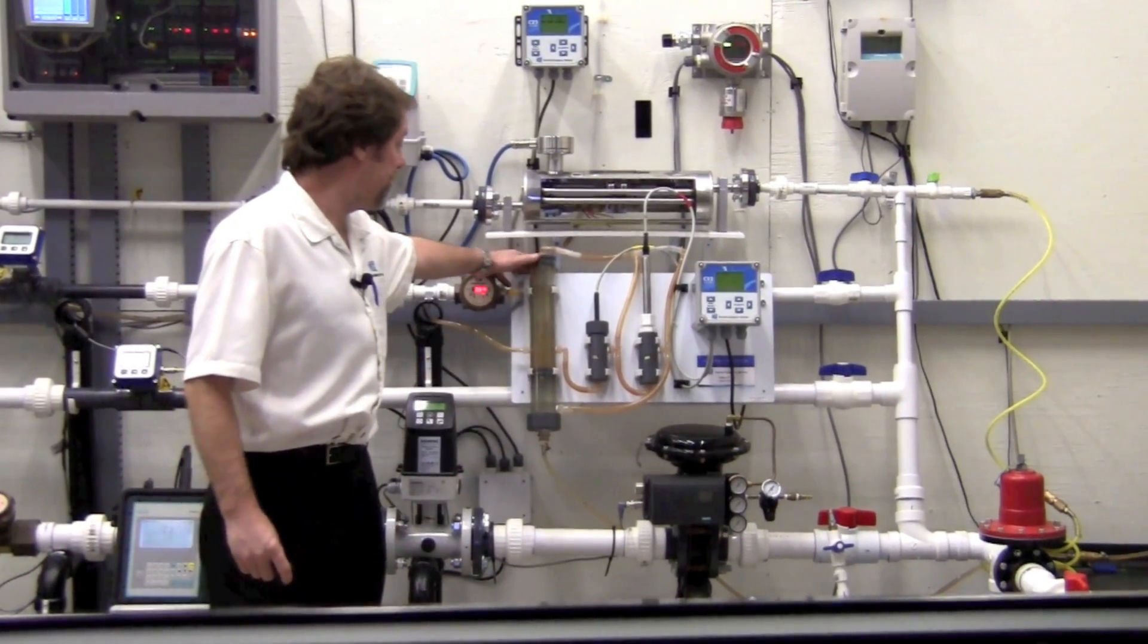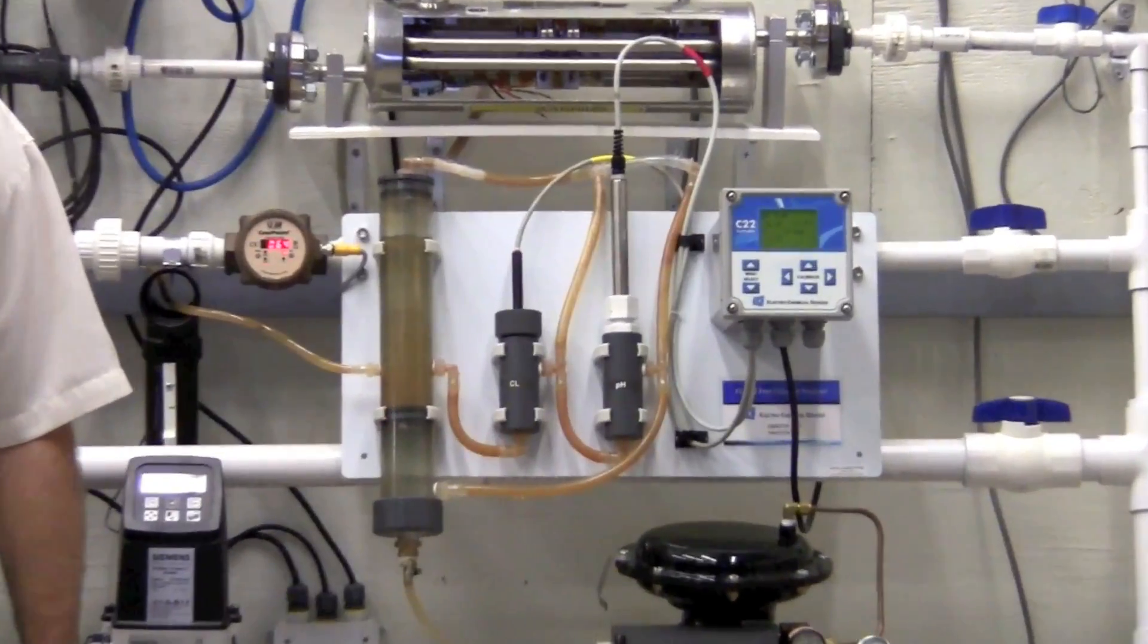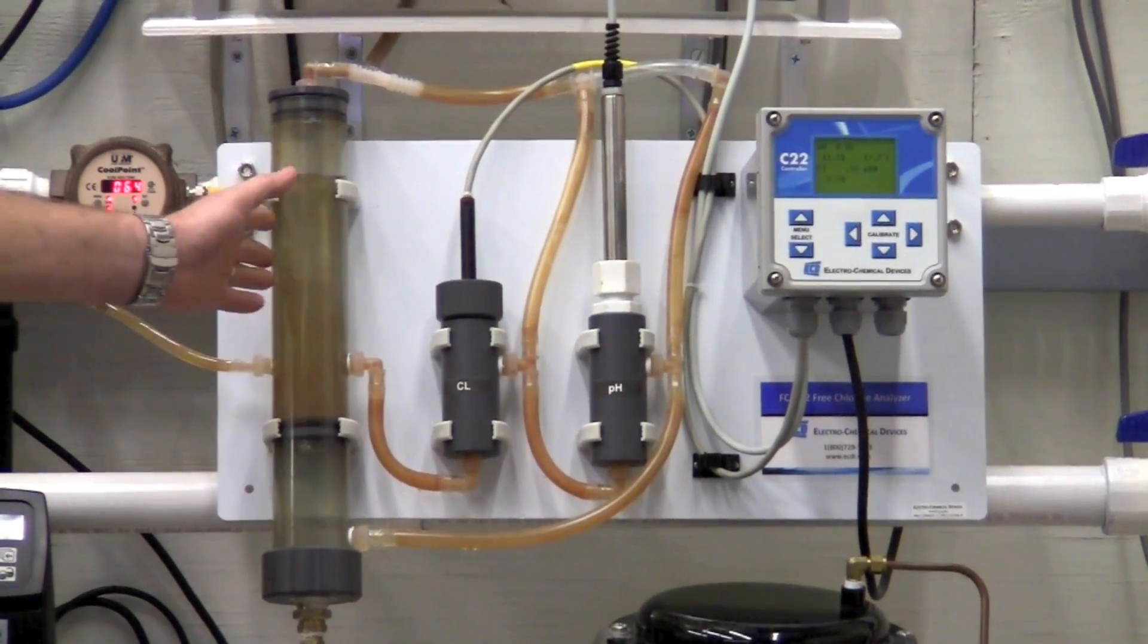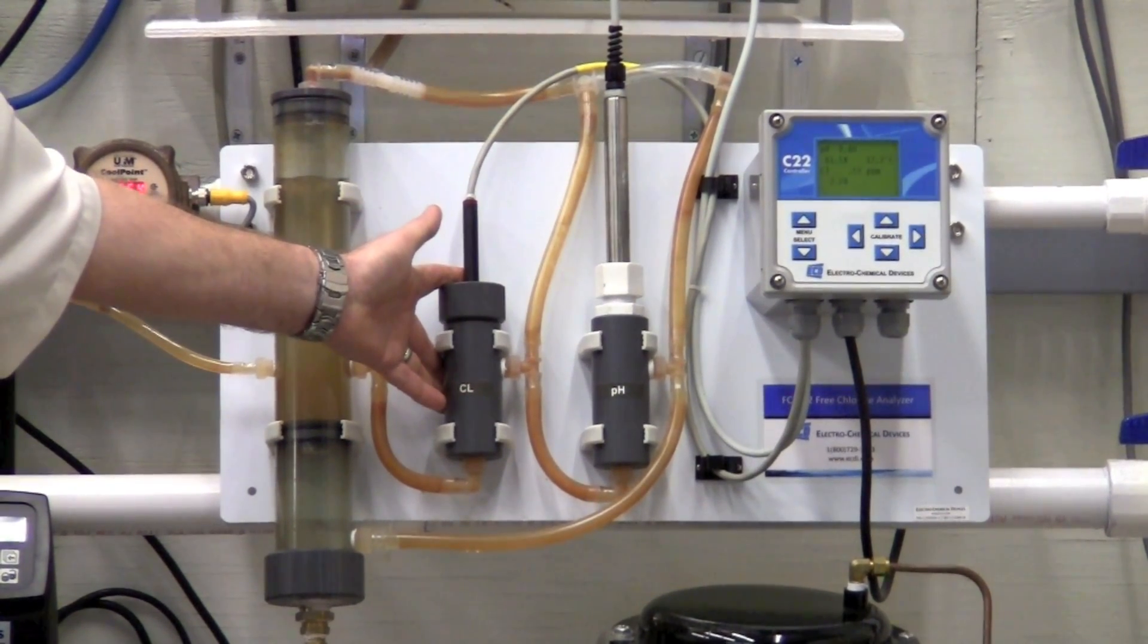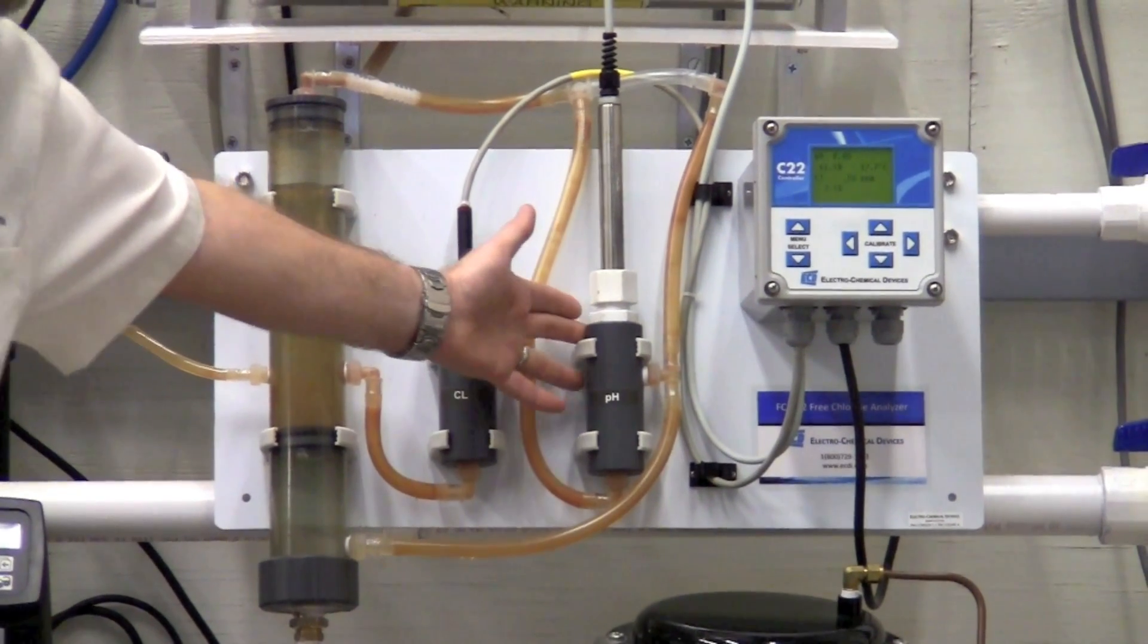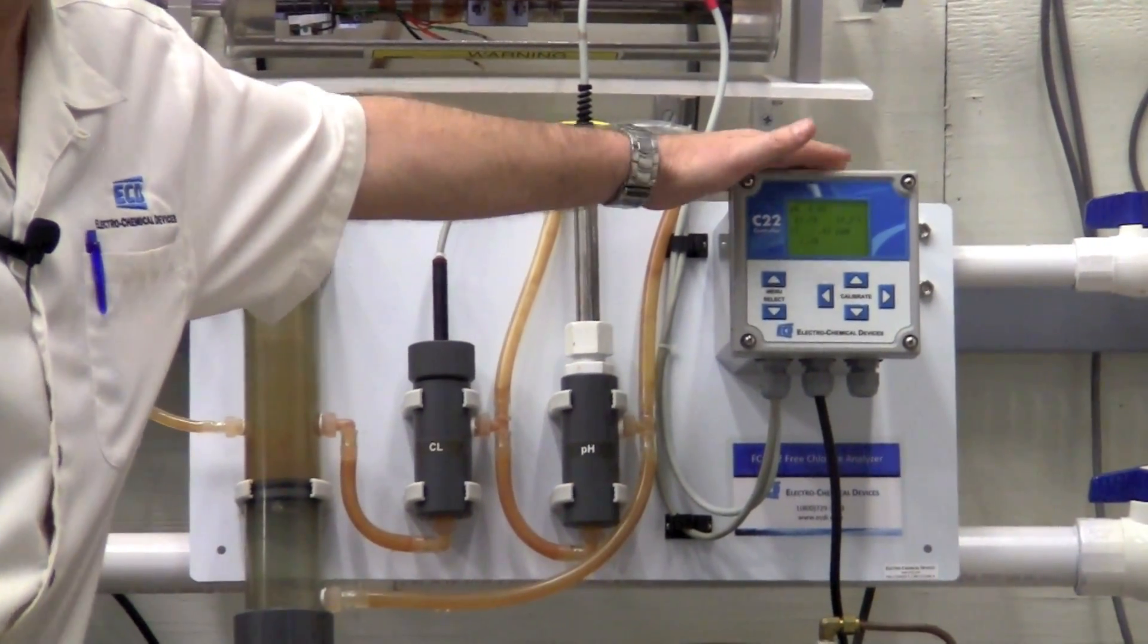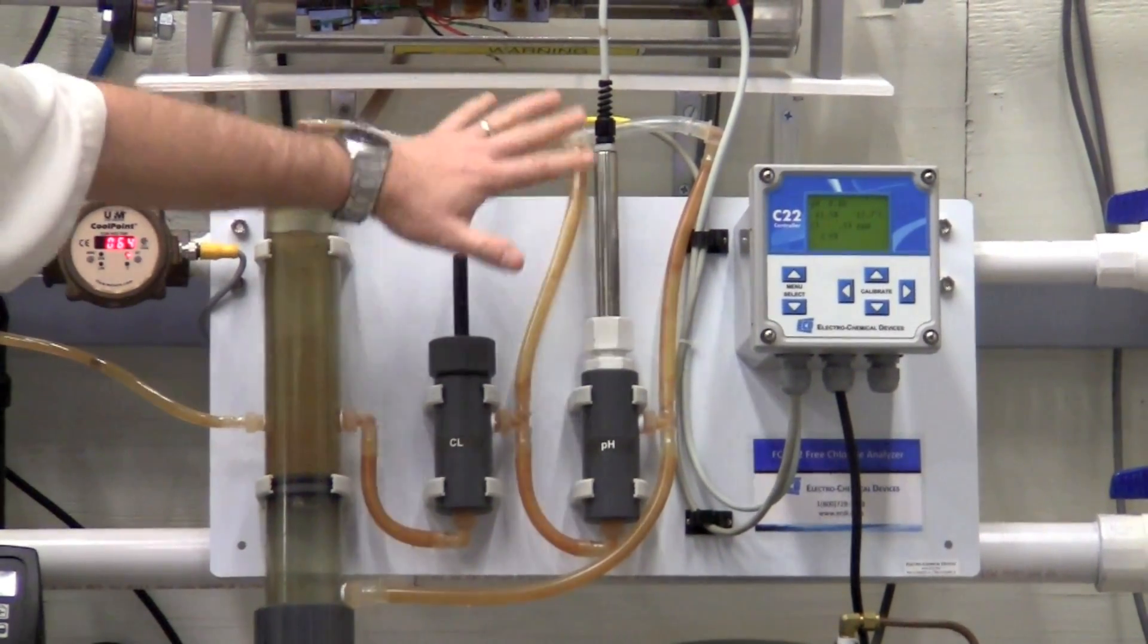Today we've got our FCA which is the free chlorine system here. The ECD chlorine system consists of a constant head flow controller, a chlorine sensor in a chlorine flow cell, the pH sensor in a pH sensor flow cell, and the system 22 controller, all mounted on a back panel plumbed and ready to go.